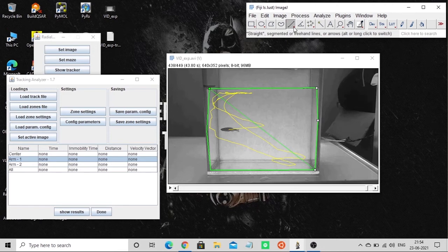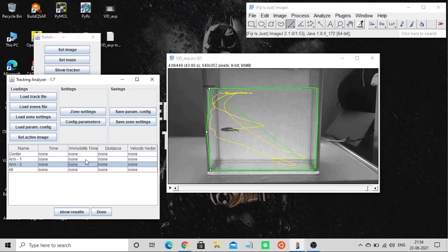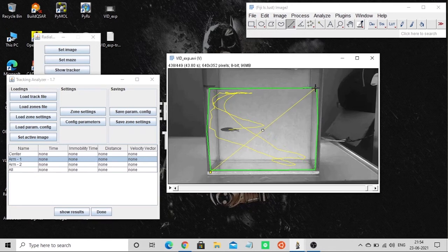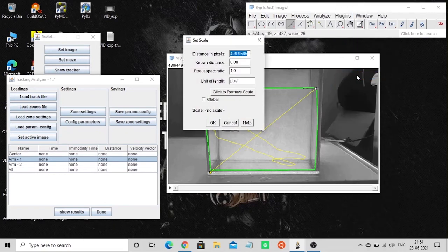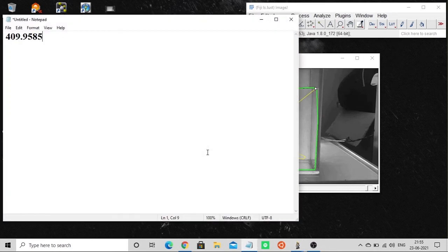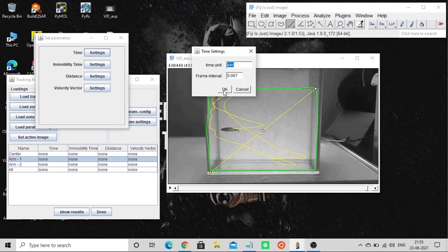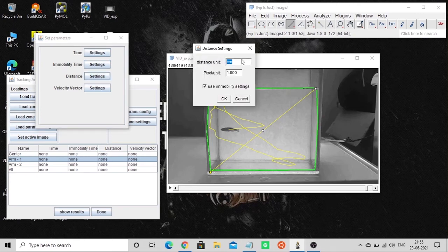I'm clicking on Free Arm 2. Go to Analyze, then Set Scale for the whole frame — you'll get the distance in pixels, so remember to copy it. Then configure the parameters: go to Time Default, mobility is not needed here. Go to Distance now and make the necessary settings.